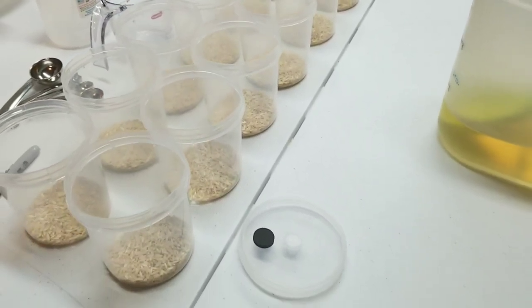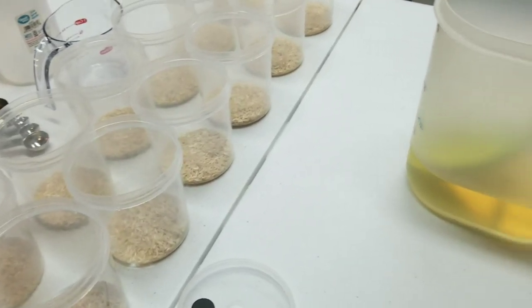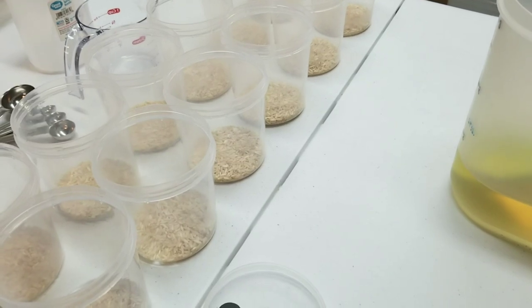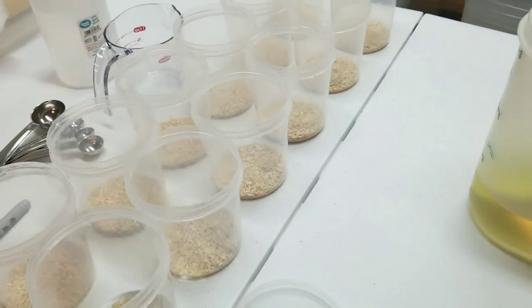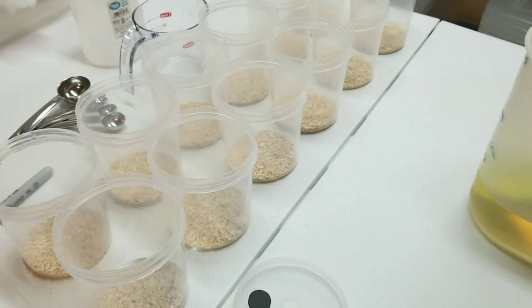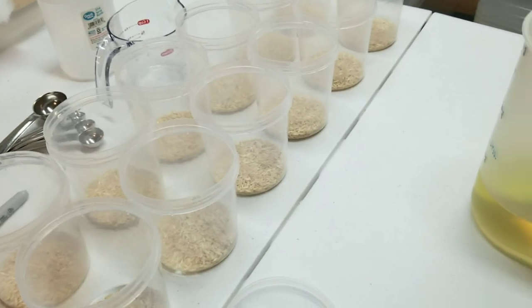If you're just starting out and don't have a flow hood, you can do a liquid culture injection in a clean room or a still air box with fairly good success. We're doing a 1 to 1.2 rice-to-broth ratio, so 30 grams of rice gets 36 milliliters of nutrient broth. We'll cap them off, put tin foil covers on, and run them for about 60 minutes at 15 PSI in the pressure cooker.